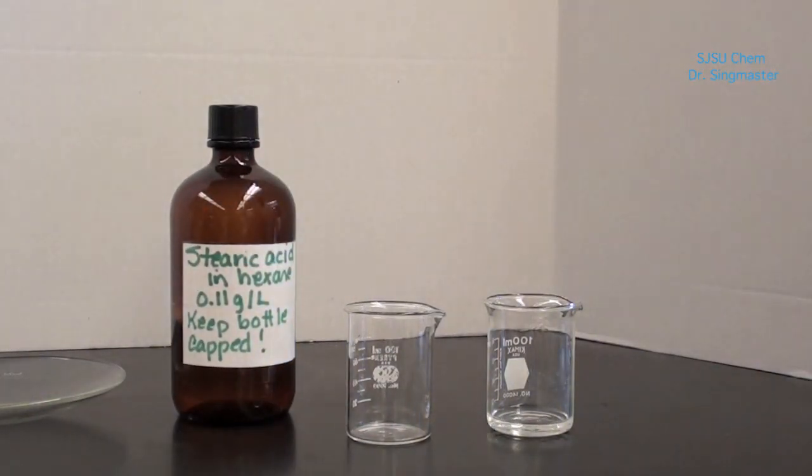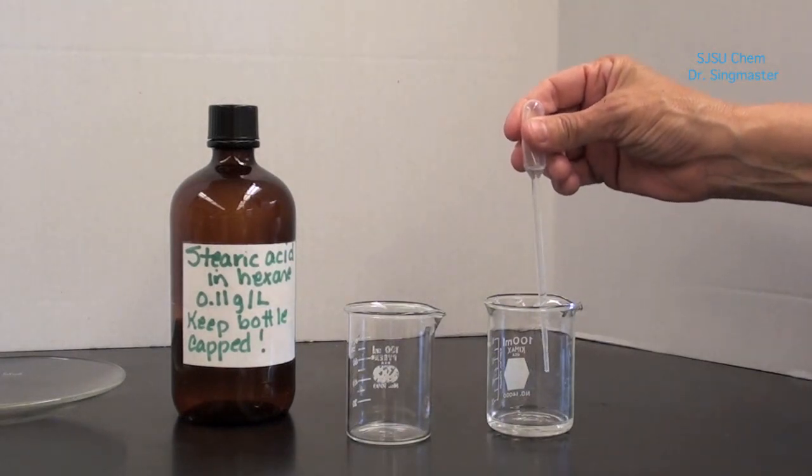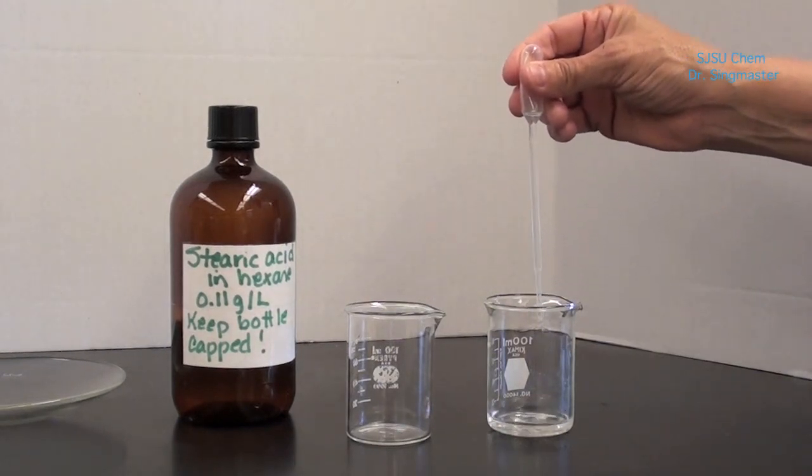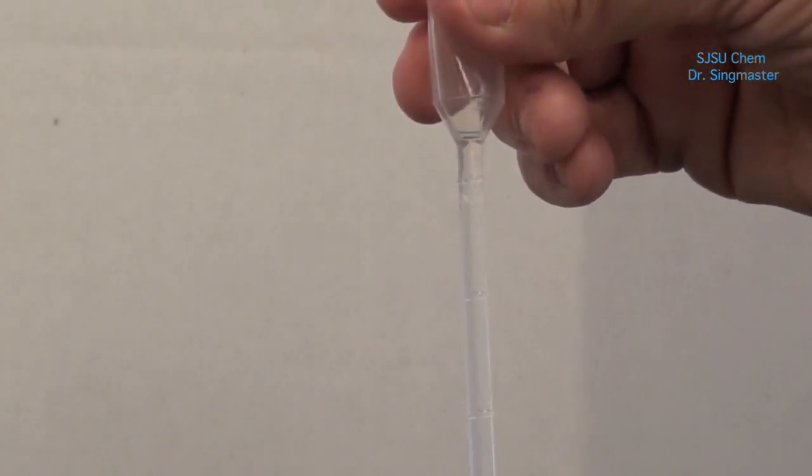We're going to fill a pipette to the one ml level and then start dropping the drops in the other beaker. Make sure to count the drops as they fall into the second beaker.